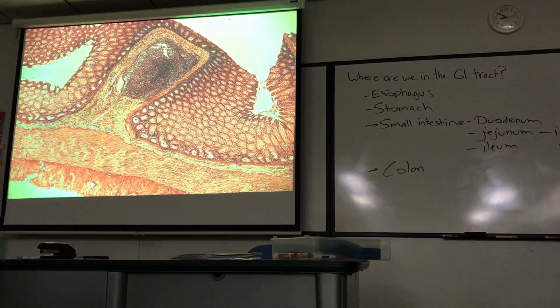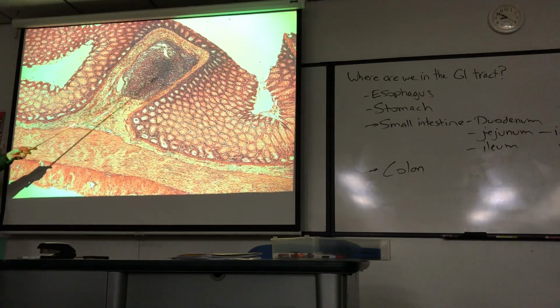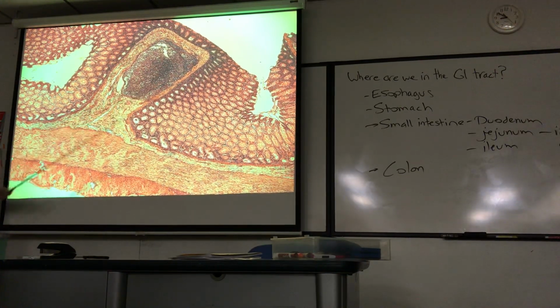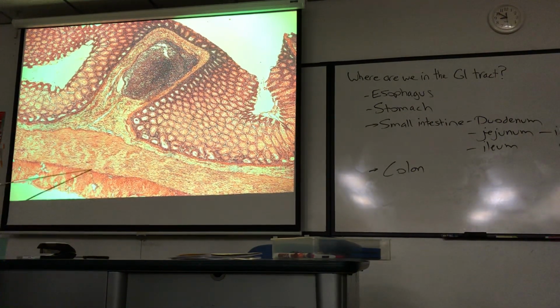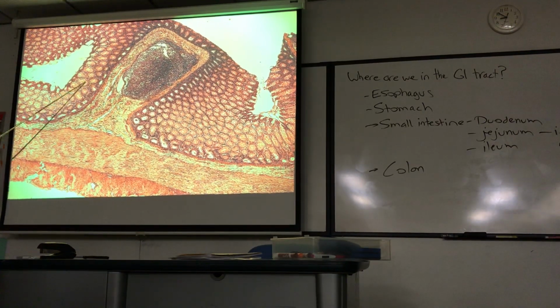There's a picture of MALT. Well, I'm not pointing to it, but do you see it? Big purple splotch right there. Well, I call it a purple splotch. The cells are the lymphocytes. They take up a purple stain. So the muscularis externa, okay, circular, longitudinal layers, submucosa, mucosa.